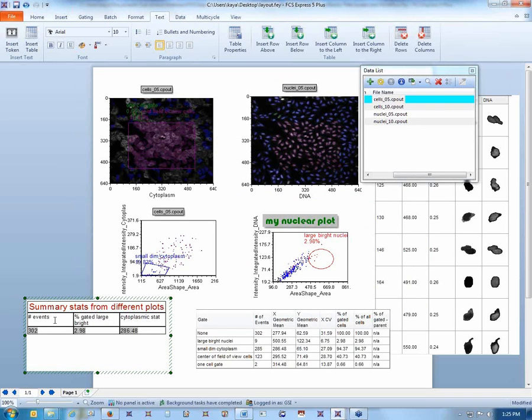And you can even make all kinds of statistics like custom ratios and things like that. And if you have any questions about that, feel free to ask, or we hope you'll join us for our statistics webinar, which will show you how to do all of that. Okay, but at this point I would like to move on to one of our other layouts.